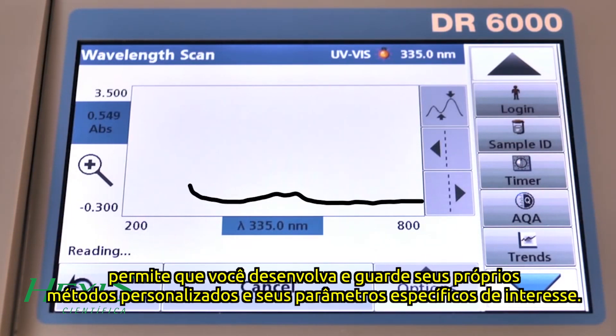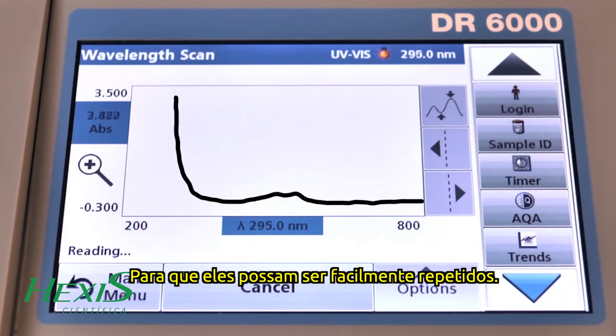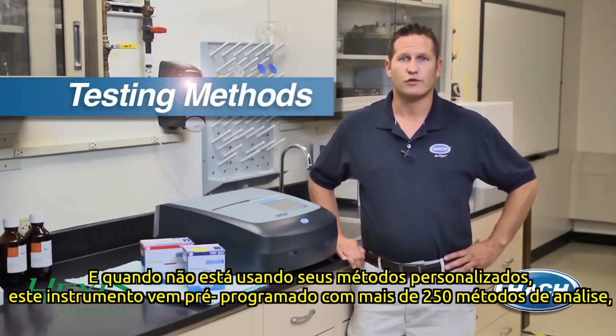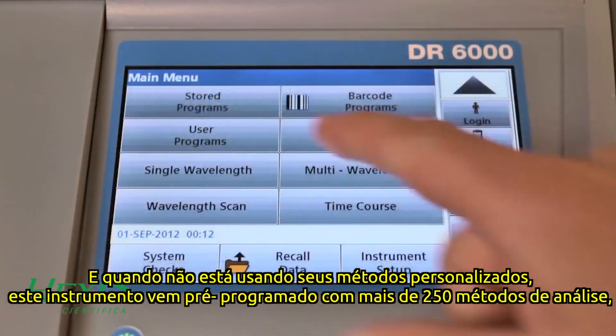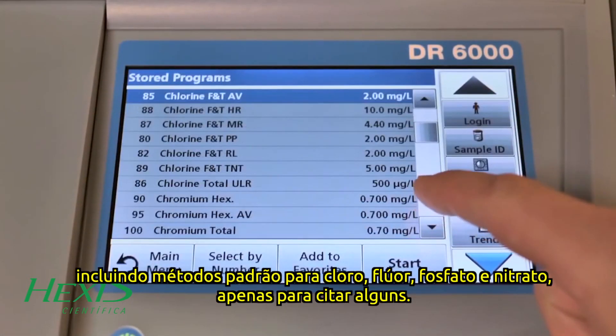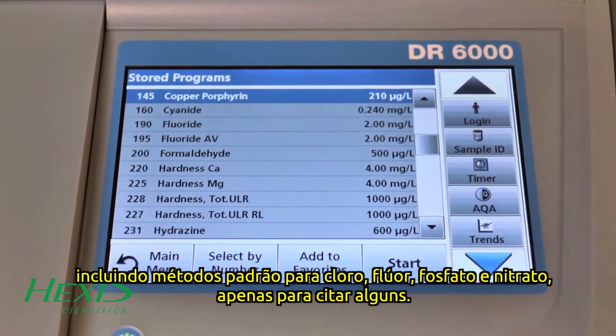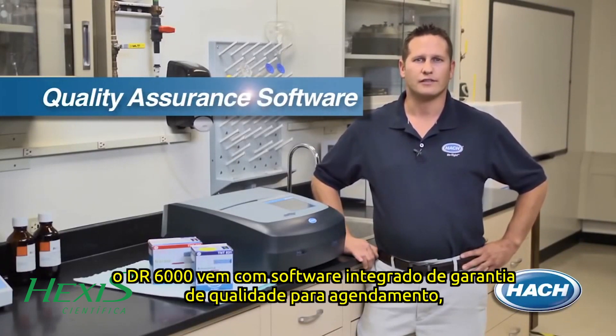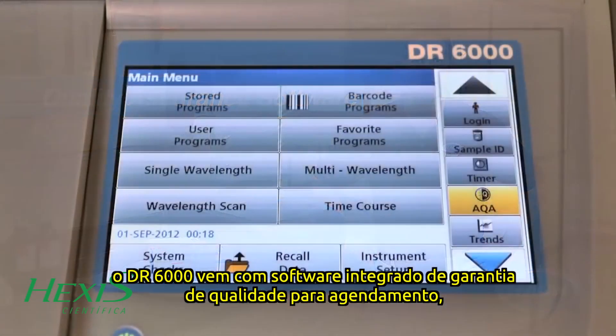High-speed wavelength scanning across UV and visible wavelengths allows you to develop and save your own custom methods for your specific parameters of interest, so they can be easily repeated. When not using your custom methods, this instrument comes pre-programmed with over 250 testing methods, including standard methods for chlorine, fluoride, phosphate, and nitrate, just to name a few.